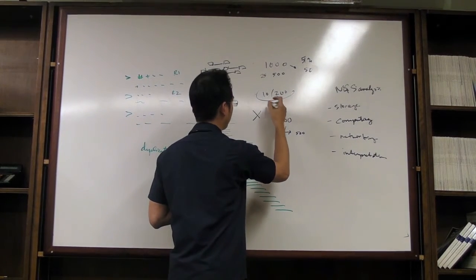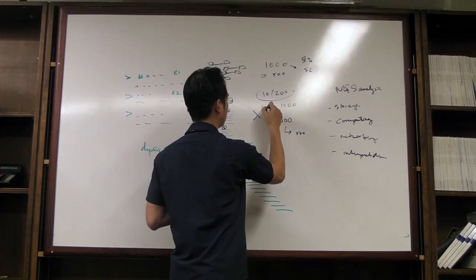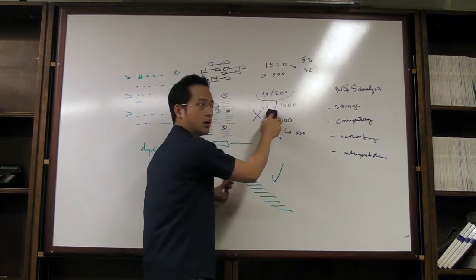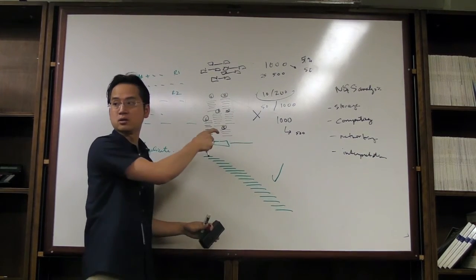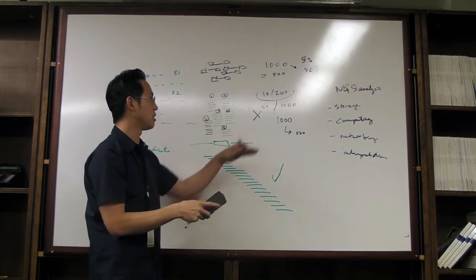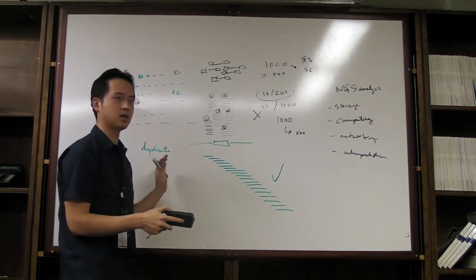you can amplify up, and let's say you amplify it back up to 1,000 during PCR. Now you get back up to 50. But this now, when you sequence, will look more like this right here. Because you have fewer duplicates. You didn't lose it along the way. And you don't have artificial duplication due to PCR. So this is an important step to do.